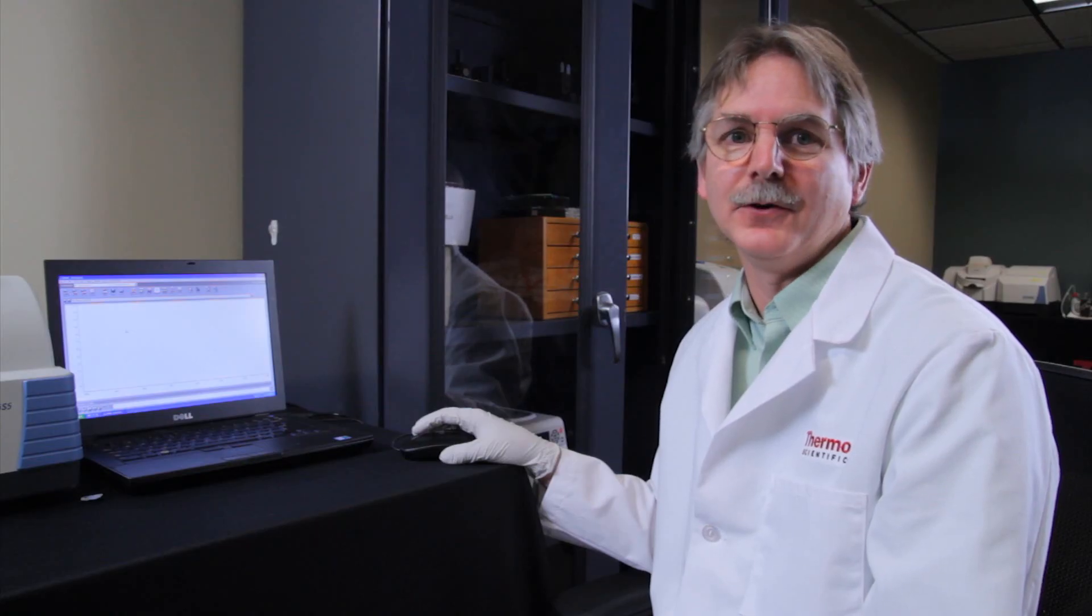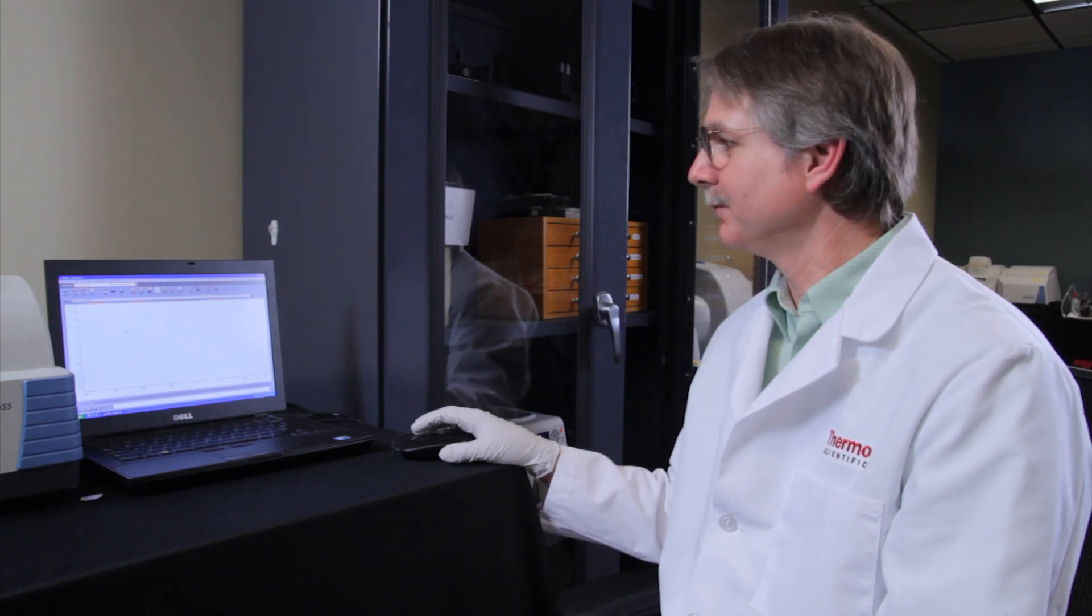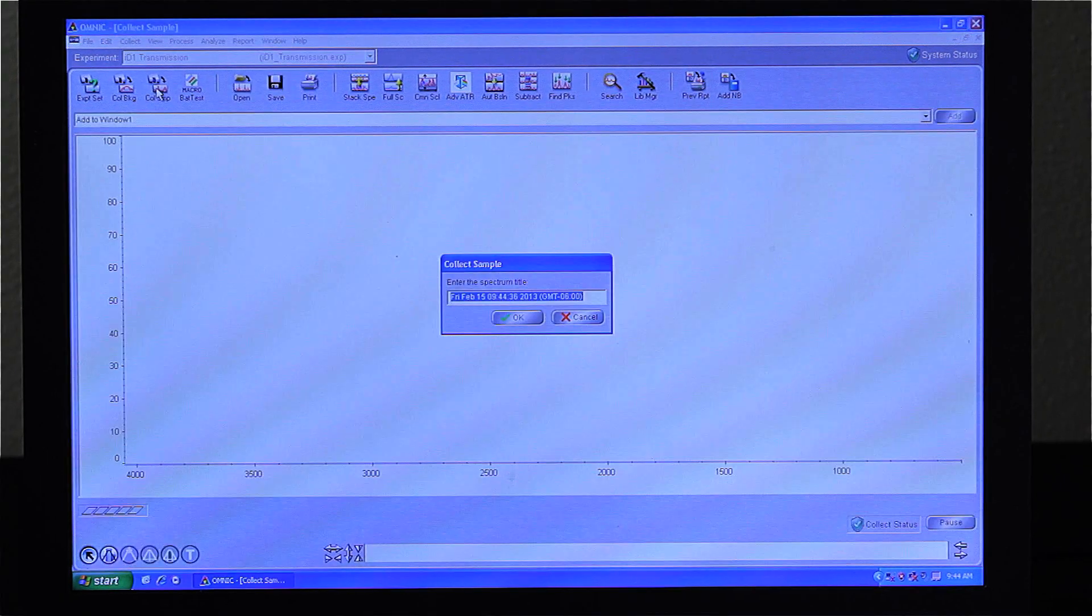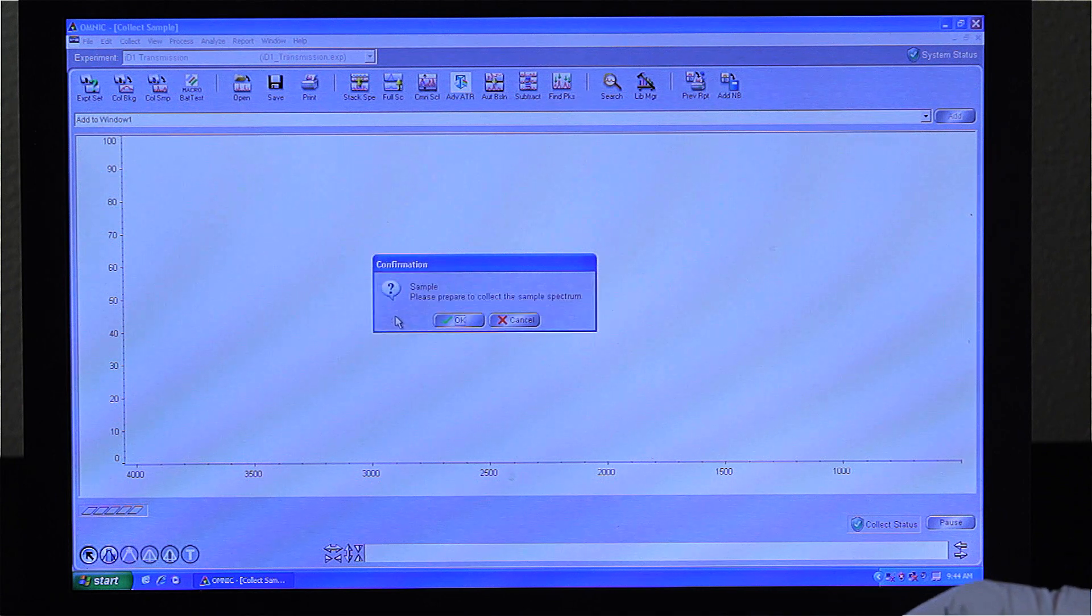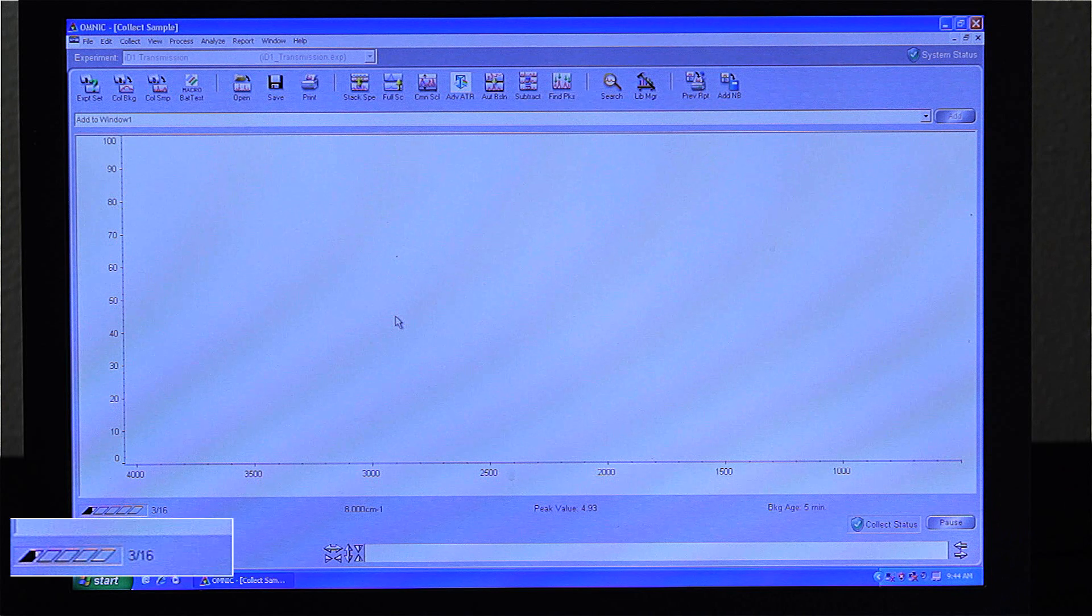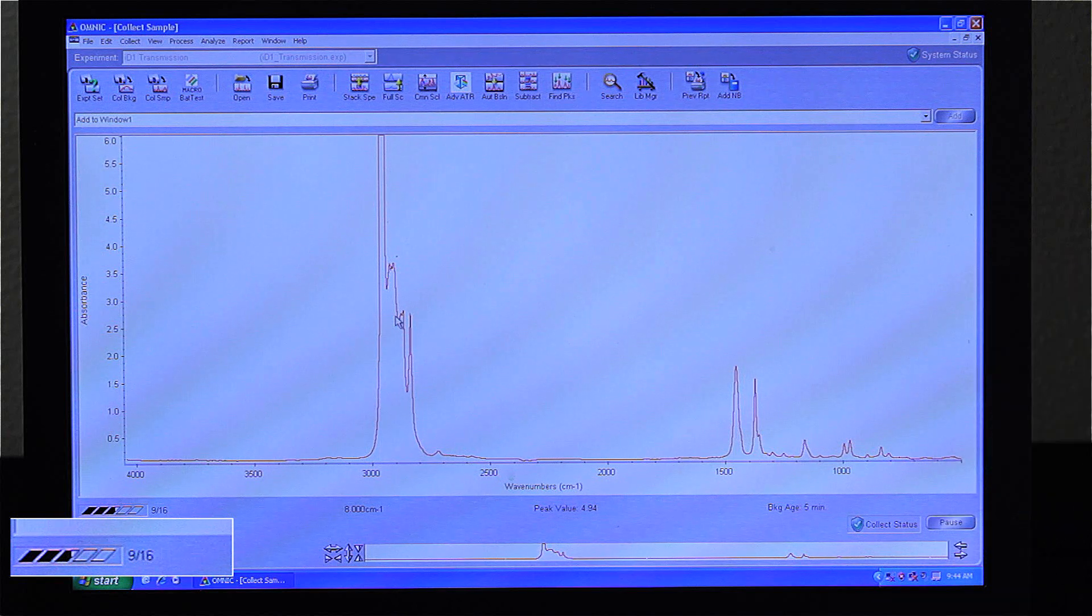With the film placed in the ID-1, the spectrum can be collected. We use our software called Omnic, where in just a few clicks, you can actually start collecting the infrared spectrum. Here you see the spectrum starting to come up. In a few seconds, it'll be ready for analysis with the library search.